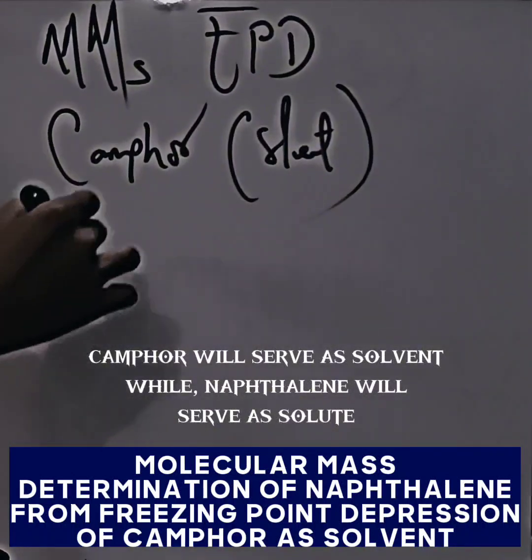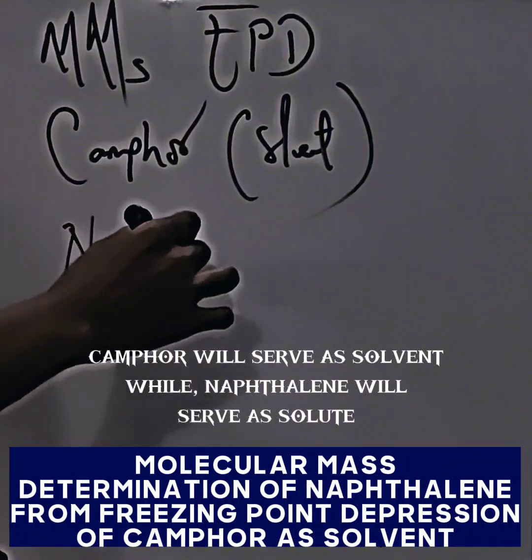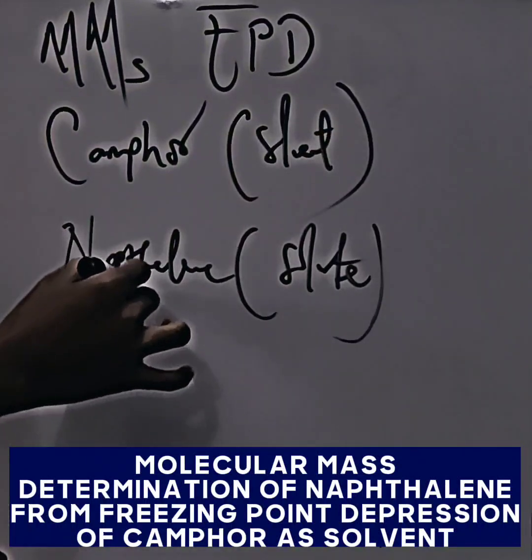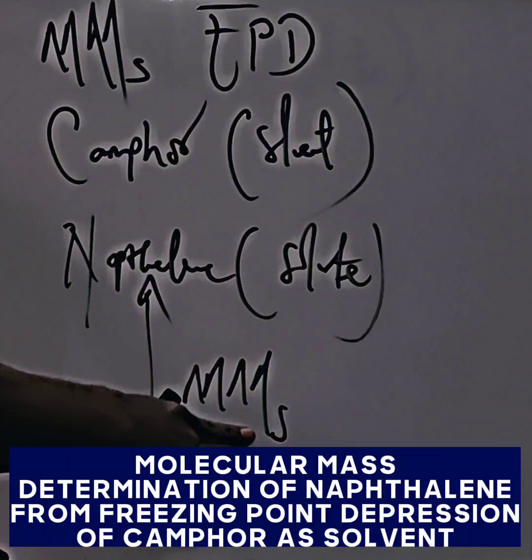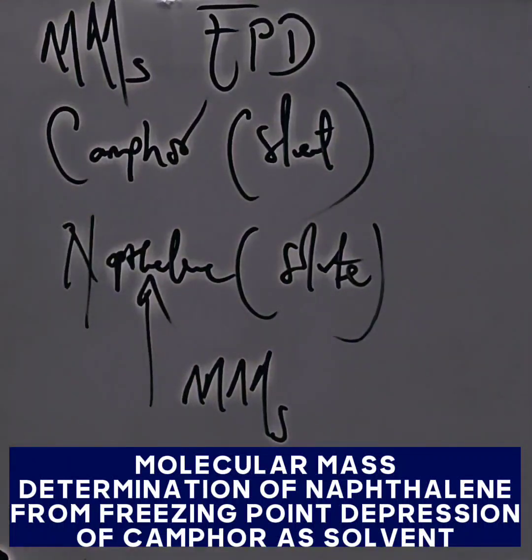Okay, so the solute is going to be naphthalene. We'll be able to determine the molecular mass of naphthalene, which is our solute, by employing camphor to be our solvent.